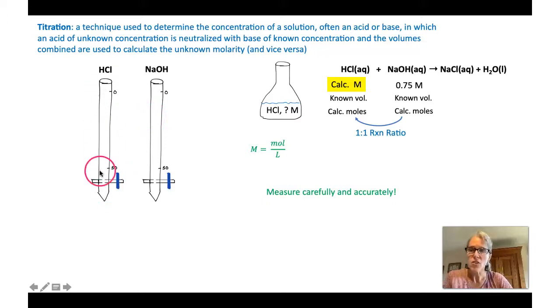So they're long, skinny cylinders that will fill up with our solution. And then down here is this stopcock. And this little blue rectangle here is kind of like a handle that you can turn 90 degrees, 180 degrees. Whenever it's fully vertical, then it exposes this little hole here and it allows the liquid to drain out. Okay, so what we'll do is we'll put a flask underneath, we'll open this little stopcock up, and we will let the HCl drain out.